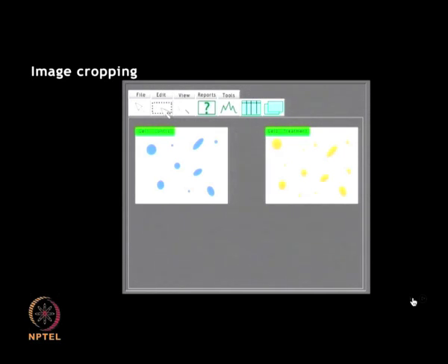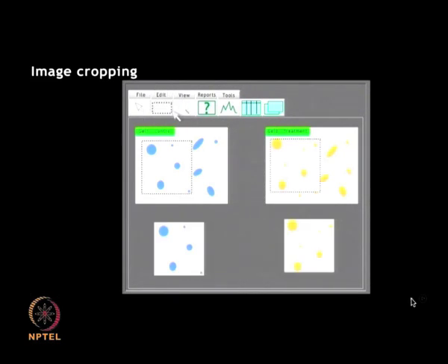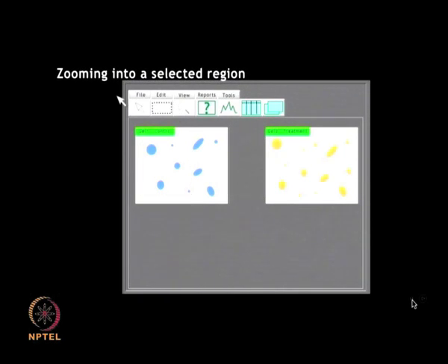You can save the gel images and then you can crop the area depending upon what area you want to analyze. There are several tools which are available for the analysis of gel. It is possible to crop the gels by selecting a specific region that is to be studied and then selecting the crop gel function. Cropping gel helps in selection of regions with high spot density or to reduce the regions which contain high background stains with no spot.